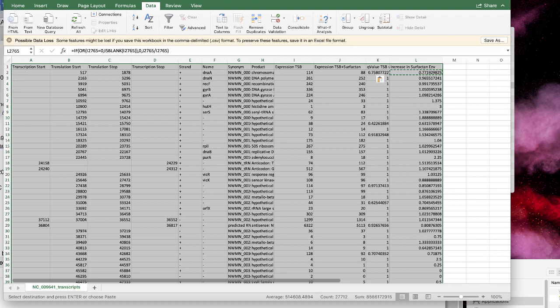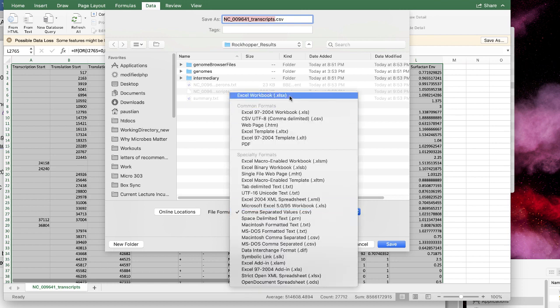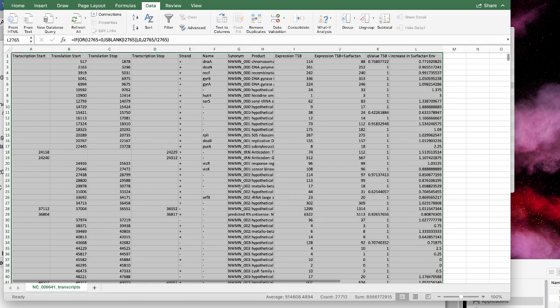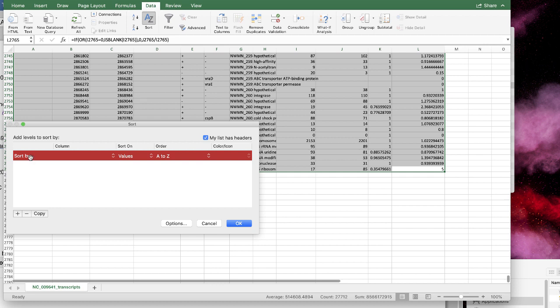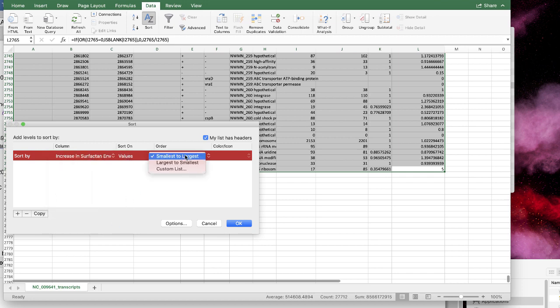First, go to File, Save As, and save this as an Excel file so nothing crazy happens and we don't lose it. Now what we're going to do is sort it. We're going to sort by the column we just made — Increase in Surfactant Environment — and we want it largest to smallest. Say OK.